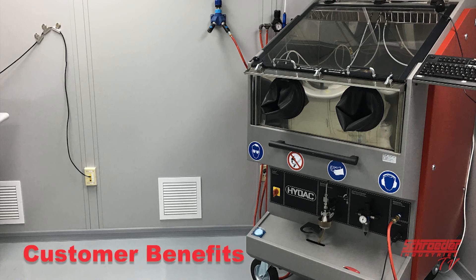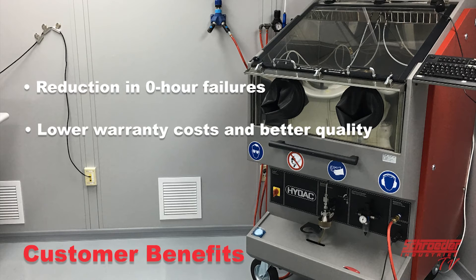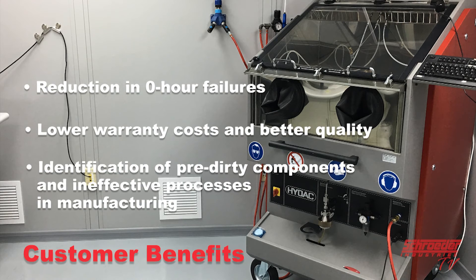Some customer benefits for the CTU are as follows: reduction in zero-hour failures, lower warranty costs and better quality, and identification of pre-dirty components and ineffective processes in manufacturing which add contamination — for example, dirty storage bins.